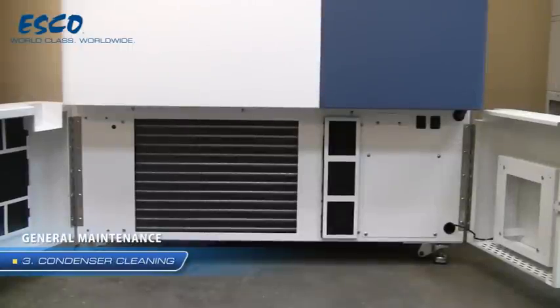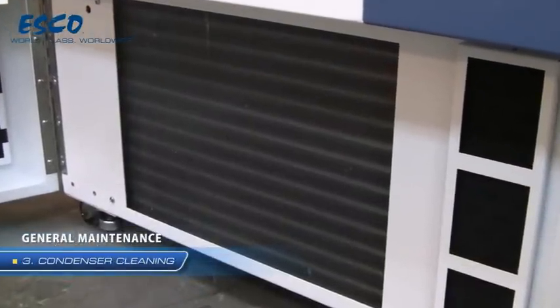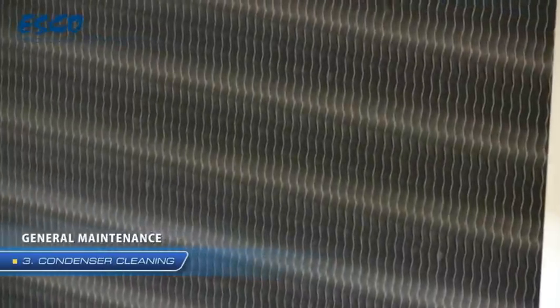Cleaning the condenser is one of the most important tasks to ensure the unit operates properly and efficiently. A clogged condenser will often result in poor performance and an increased power consumption.